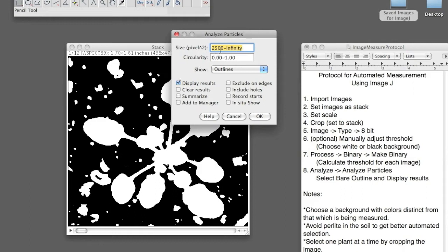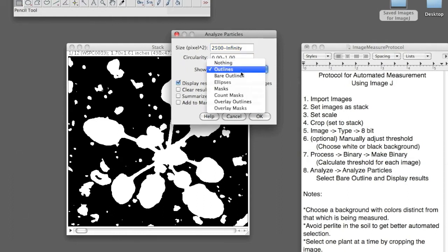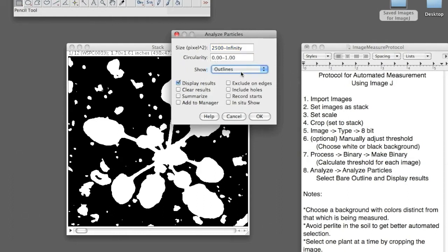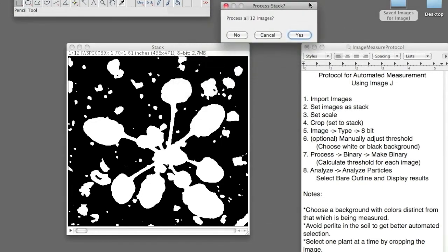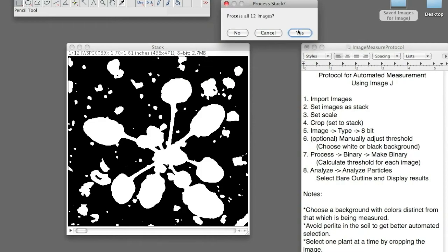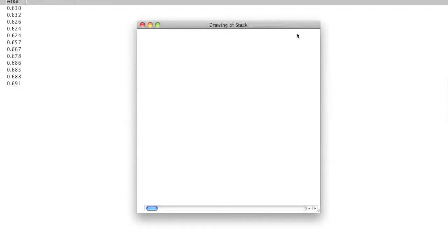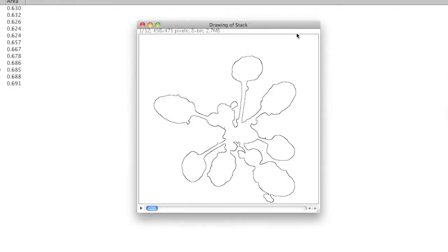Next, you want to go to Analyze, Analyze Particles, and select the minimum size for the areas selected. I selected 2,500 pixels squared. I only figured that out by experimenting. And you'll be able to figure it out once you start seeing your data output, and maybe you want to experiment around. And then I selected for it to output Outline and Display Results.